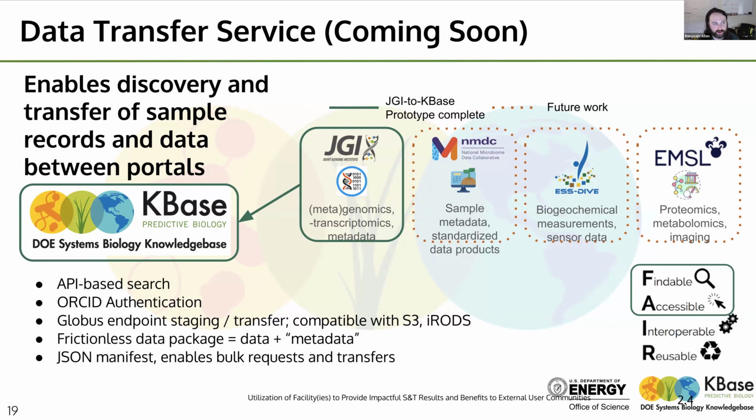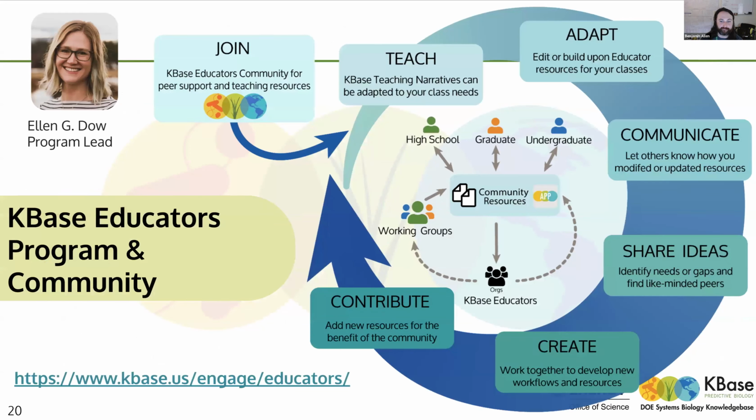We want to build a portal and a transfer service that allows us to integrate data from all of these other projects into the platform and then serve that up to you all as a research community, so that you're not just accessing, for instance, RefSeq genomes, but you can also access projects on NMDC or metabolomics data from the Environmental Molecular Sciences Laboratory, and do that directly within the platform.